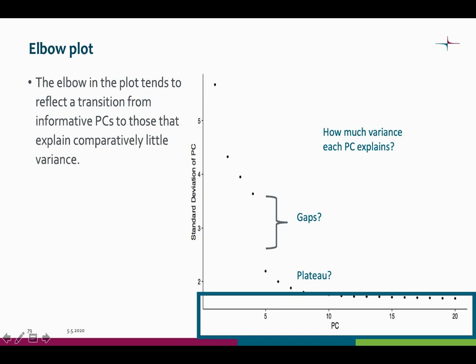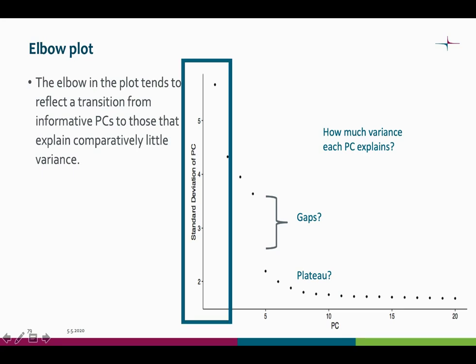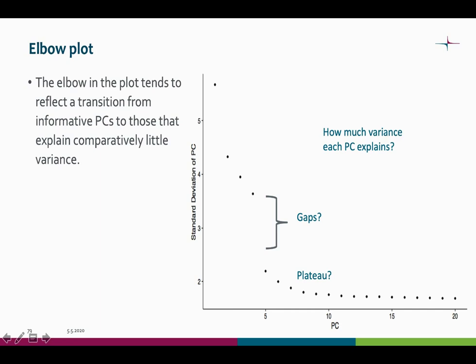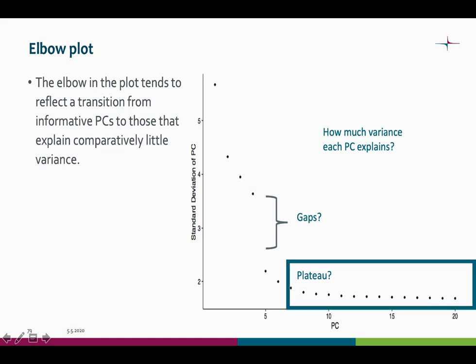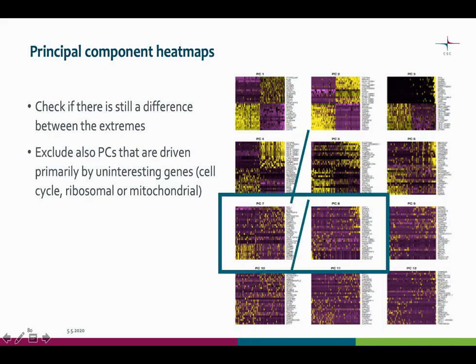The elbow plot is one of the plots you can use to determine the number of principal components to use in the analysis. By default we count 20 of them, and the plot shows the standard deviation of the principal components — how much variance is explained by each. How to decide which to include? You can look for gaps or when the curve reaches a plateau. Looking at the heatmaps is another option: you are trying to check if there is still a difference between the extremes. Where to draw the line is hard to say — you might want to do some test runs.